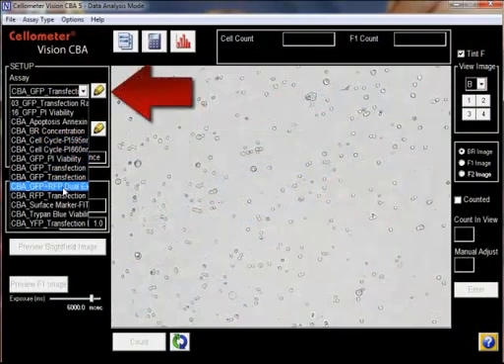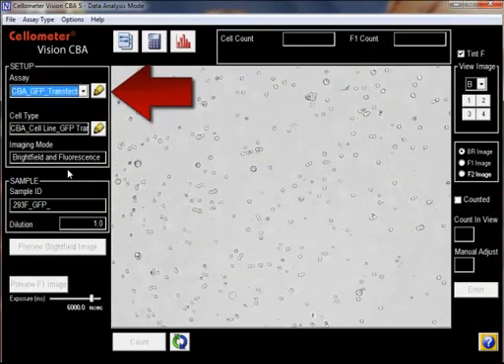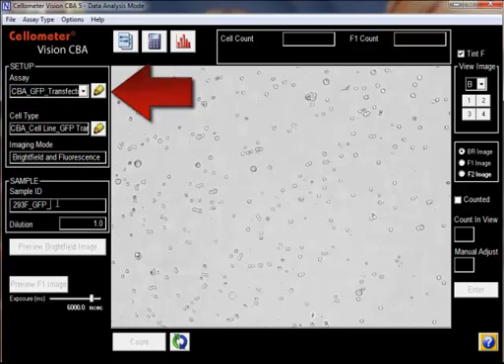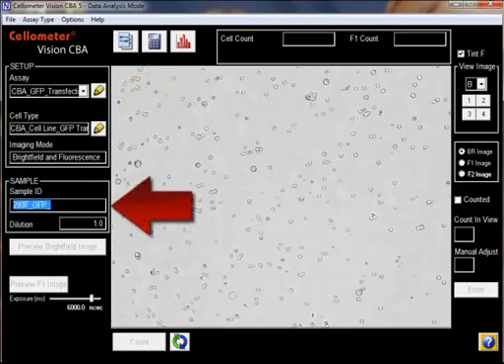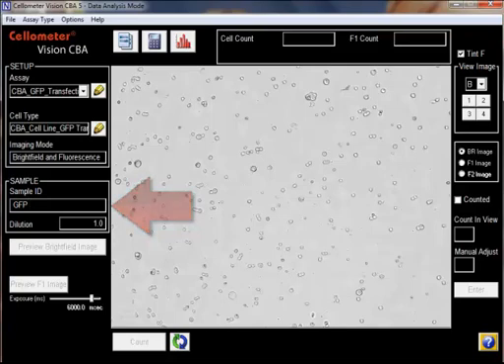Select the GFP transfection assay from the drop-down menu. Enter the sample ID and dilution factor. Then, click Count.